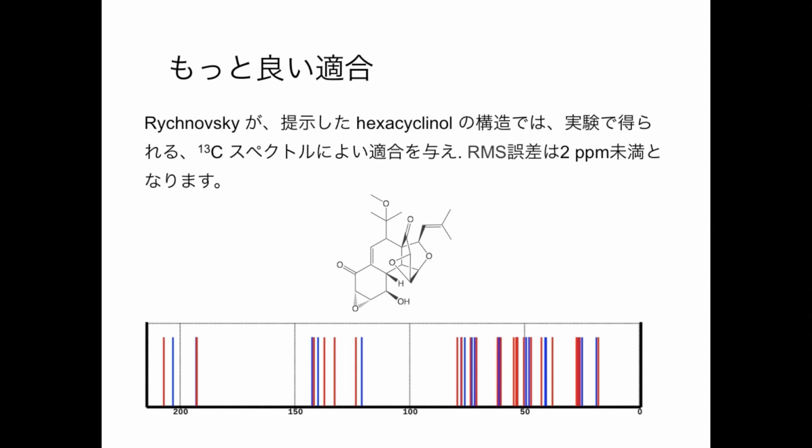Here is the current candidate of the right structure, and I can't pick on this as far as being bad. If you actually count batches of lines, they're fine. But again, to do this right, I have to decompose the spectrum and look more carefully, and I don't want to spend the time at this point. Okay.